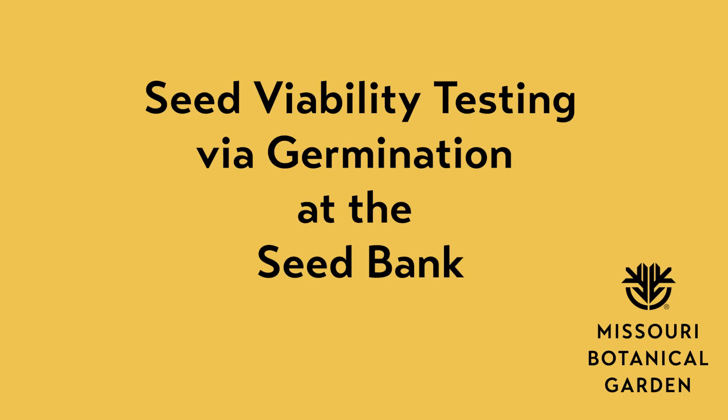Hi, I'm Katie Pittman, Seed Bank Specialist at the Missouri Botanical Garden. In this video, we'll walk through the steps I used to conduct viability testing on the seeds stored in our seed bank.